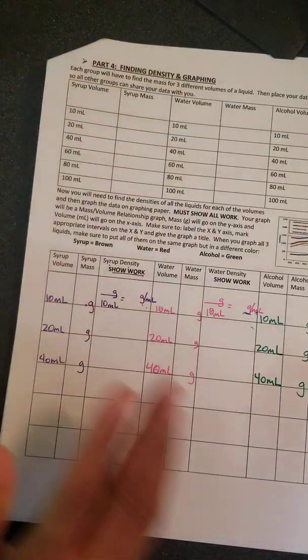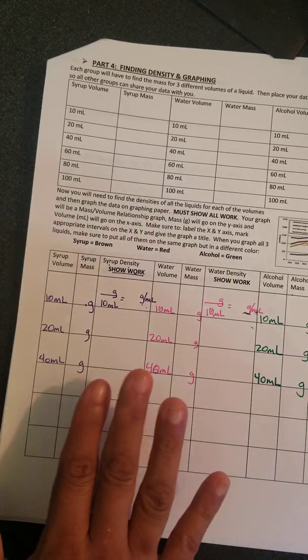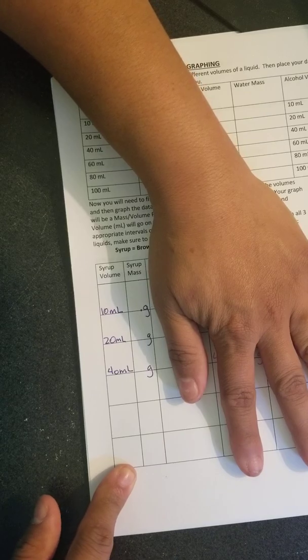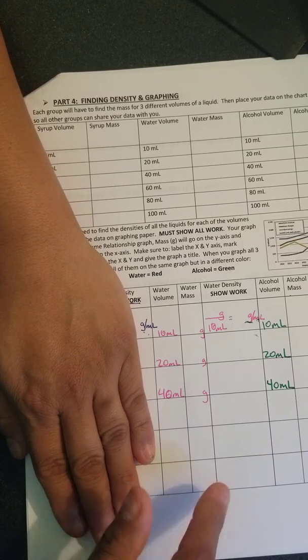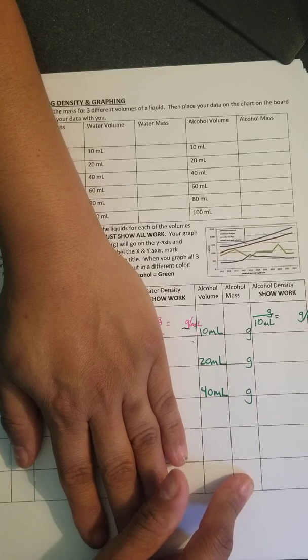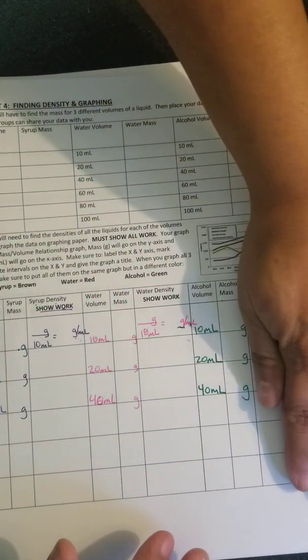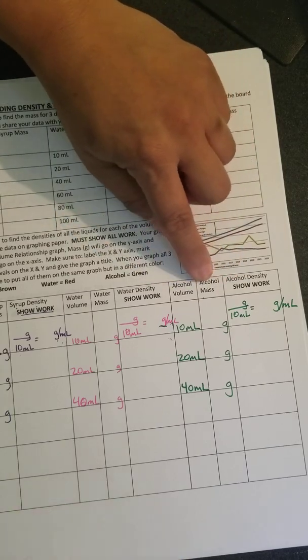Okay? You're going to do that, and then from here you're going to use the volume and the mass numbers to do your graph. It's going to be in brown for your line. The volume and the mass to do your graph, it's going to be red. And then the volume and the mass on your graph, and it's going to be in green. You are not going to graph the densities. You're going to graph the volume and the mass.